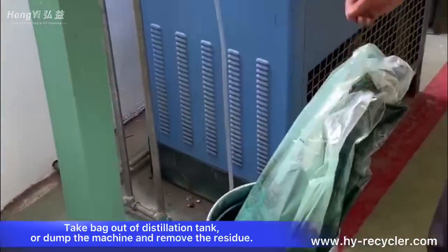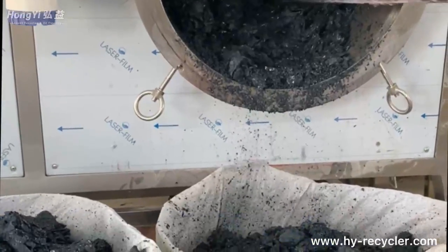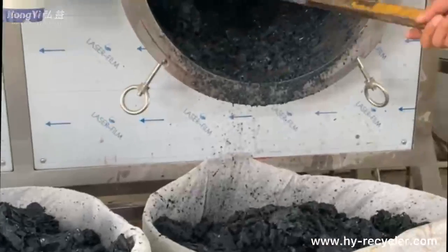Take the bag out of the distillation tank, or tip the machine to dump and remove the residue.